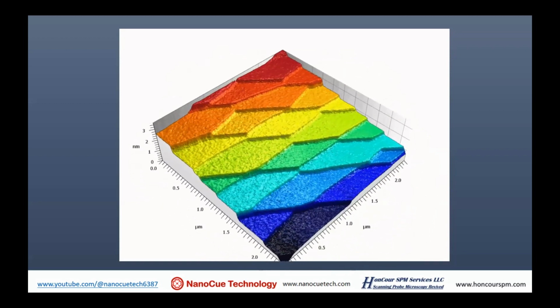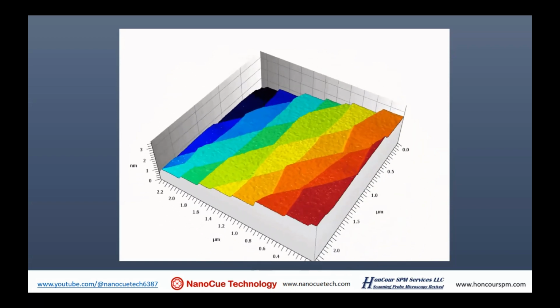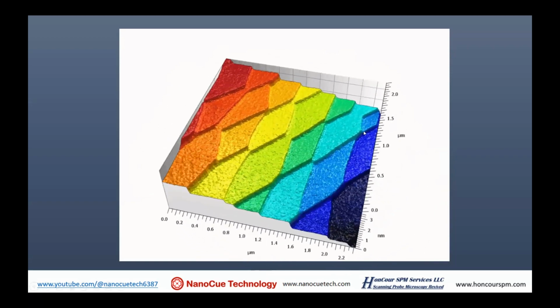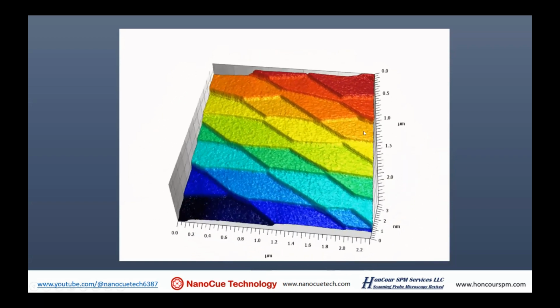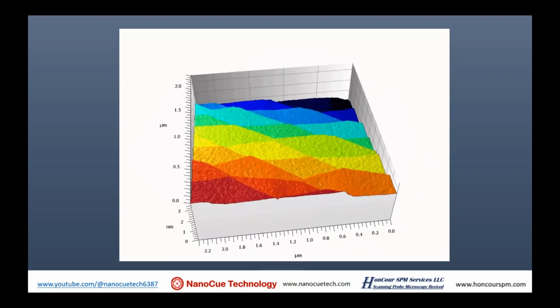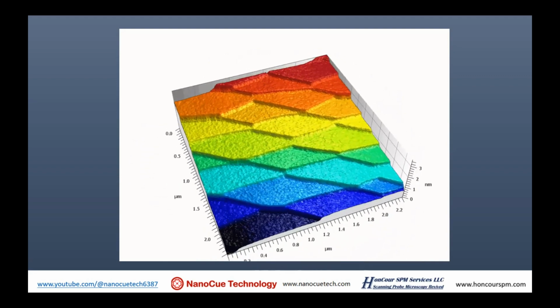And this is one of my demo data. When I say demo data, it's when people show up with a sample and they get their result. Every time it's within 1 or 2 hours, so we don't have time to re-prepare the sample. All we did is put them in isopropanol, image in liquid, and then increase the force set point, so the contamination is wiped out.